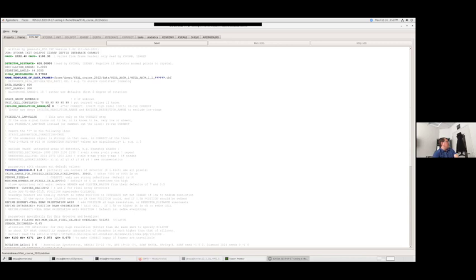Include resolution range is where you can set a high resolution limit if you want, and a low resolution. In our case, we generally prefer to tell it to go to something lower, a low resolution of 200. Now, in actuality, that low resolution limit is going to be masked off by the beam stop, but the low resolution that we can detect is actually lower than 50 angstroms, and so we don't want to exclude any information that we don't need to.